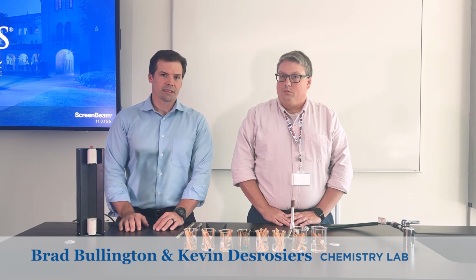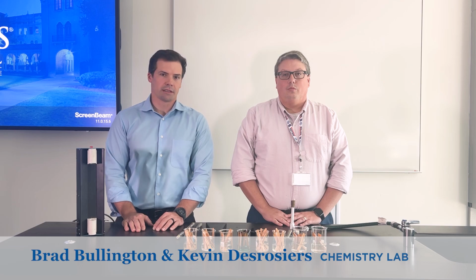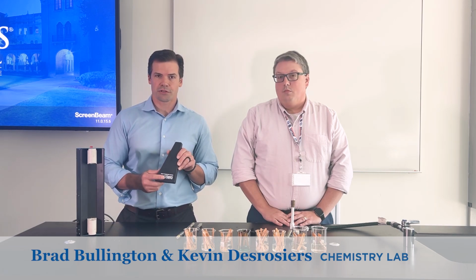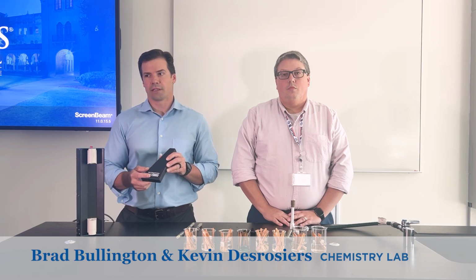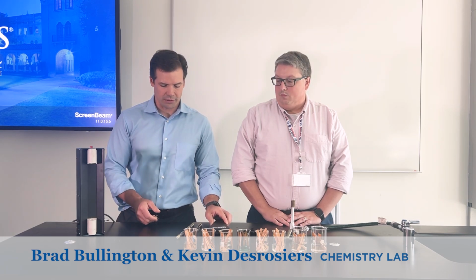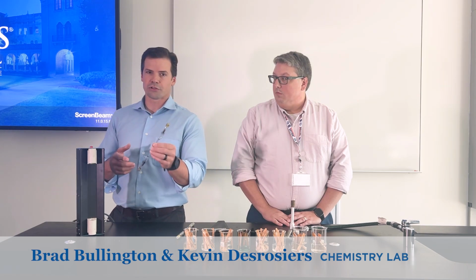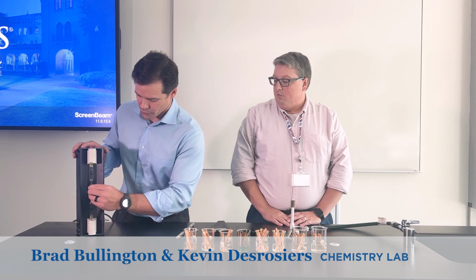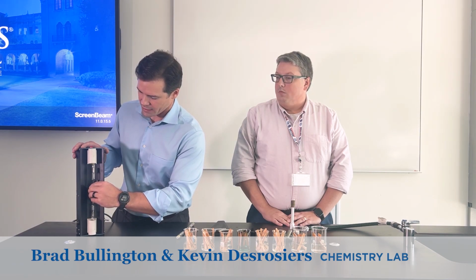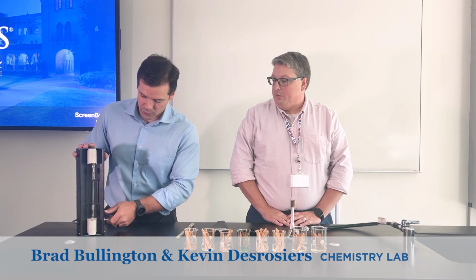And you'll see that my colleague, Kevin Desrosiers, his students are going to be working on this today. And they're going to be taking a spectroscope and also a spectrometer where they're going to be analyzing the flame colors that are given off, or the colors of the gases that are excited in these tubes. So not only can metal elements be excited, but other non-metal elements can be excited as well.